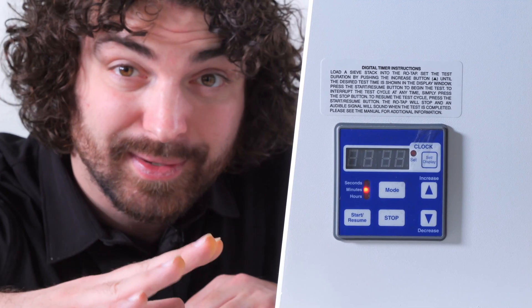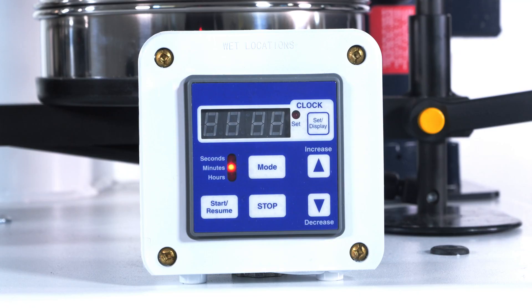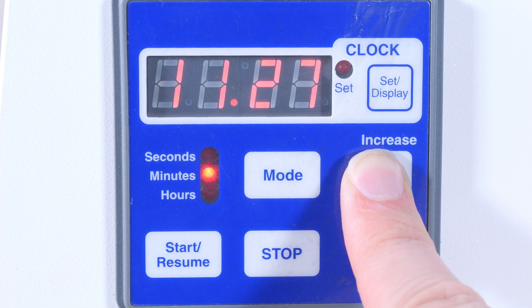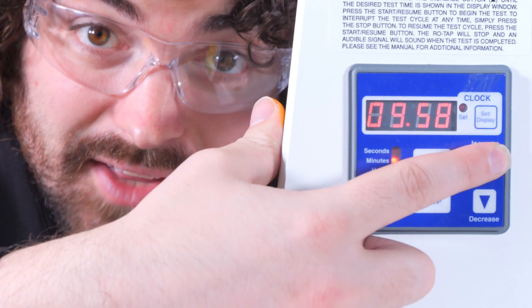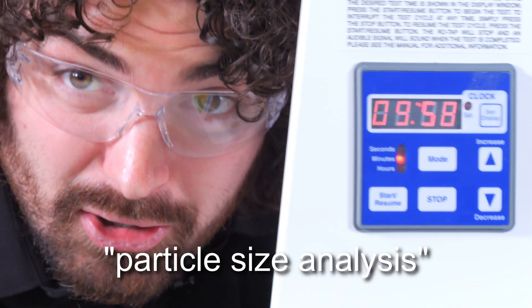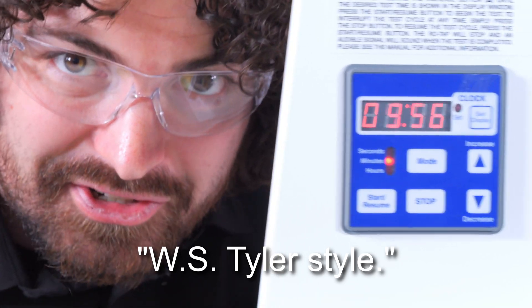All of our mechanical sieve shakers use the exact same interface. They can all run up to 99-minute operations with a tolerance level down to 0.1 seconds. Just set the time you want, press start, and you are now conducting particle size analysis, WS Tyler style.